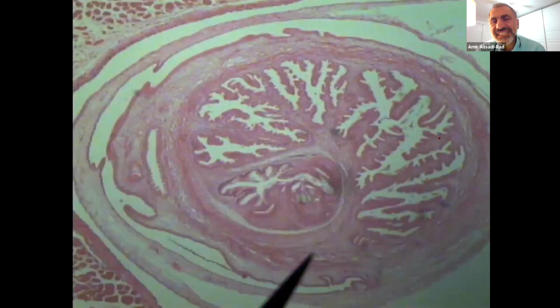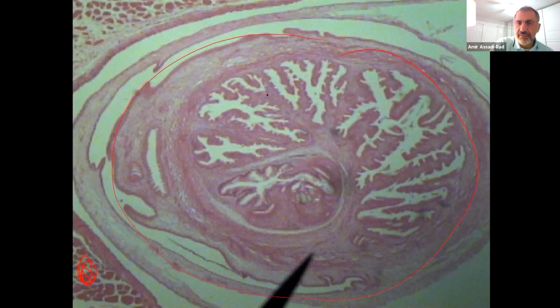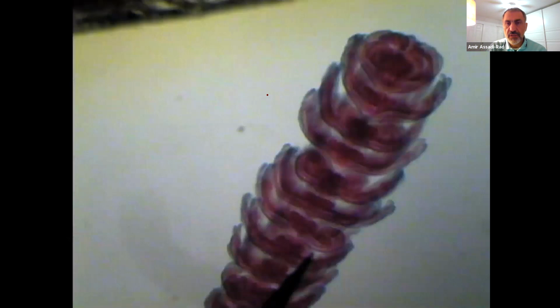Very important. This is Cysticercus of Taenia solium. Cysticercus, the whole thing. If you look at the sides right here, that's skeletal muscle. But the whole entire thing right here is Cysticercus. And when they look at the meat of the animals, it's a white knot. So of course the USDA condemns it. You cannot sell it into the market.